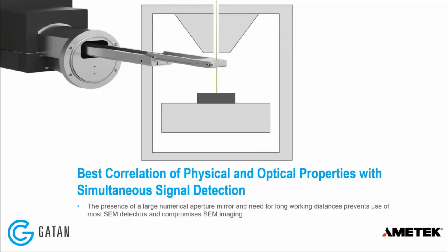Changing tack slightly, I do want to go over some of the advancements we've made in your ability to correlate the cathodoluminescent signal, which hopefully I've convinced you is a really interesting thing to collect in the SEM already, but how to correlate that information better with the other signals that are available within the electron microscope.